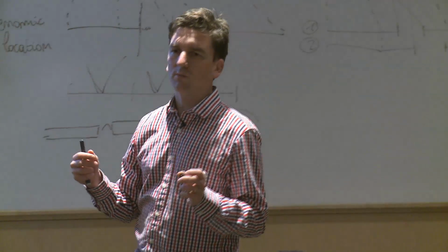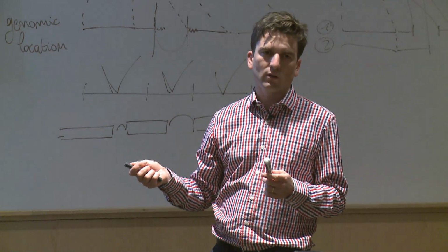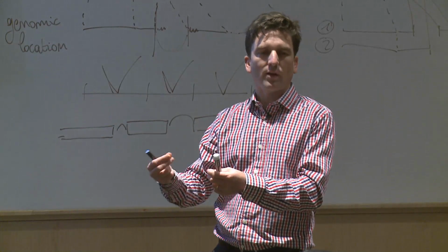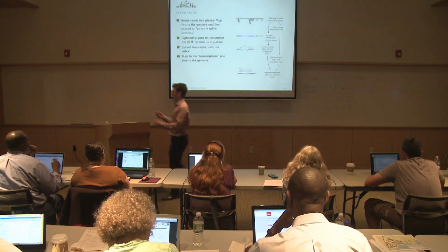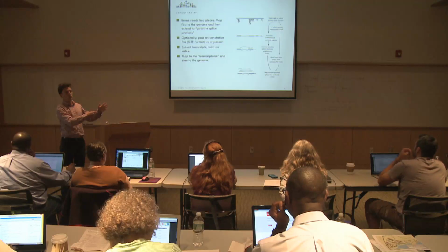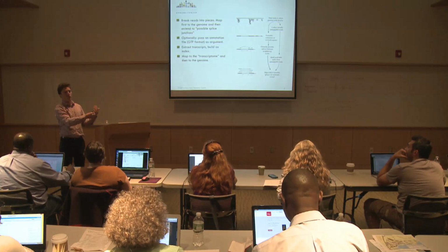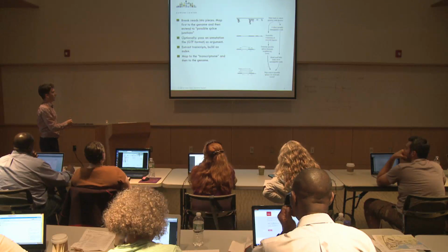But again, if you have an annotation, you can give it as a parameter, and that will guide the alignment to this annotation. The issue is that you bias towards known junctions, and so you have a little bit less power to discover novel splicing junctions. So that's a trade-off that you have to find.